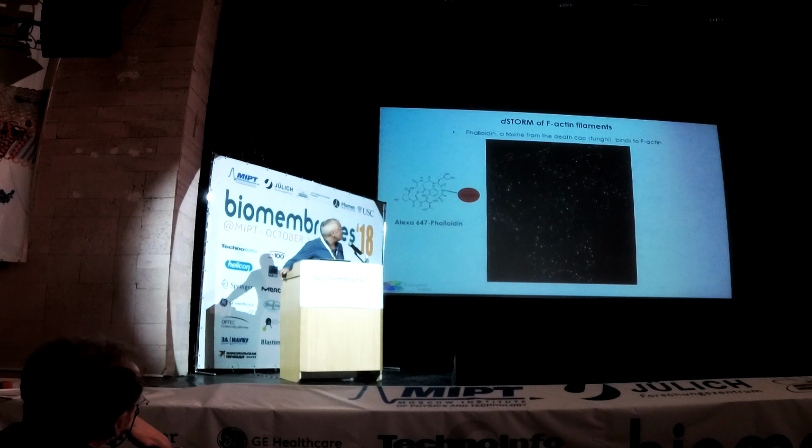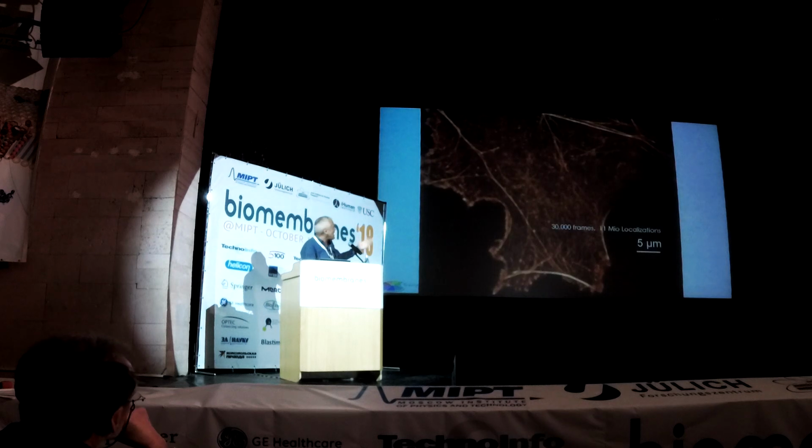You record this video and you see that only a sparse subset of all these fluorophores is in an active fluorescent state at any time of the experiment, and that the distance between these point spread functions is large enough, which allows you to fit these point spread functions, or approximate the center of mass, using a 2-dimensional Gaussian function. And then you end up, after some time, with 11 million localizations in a super-resolved image.